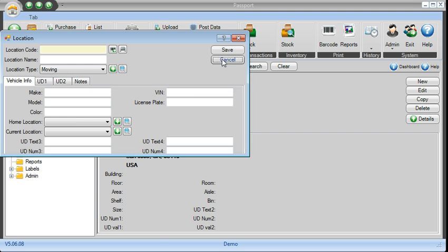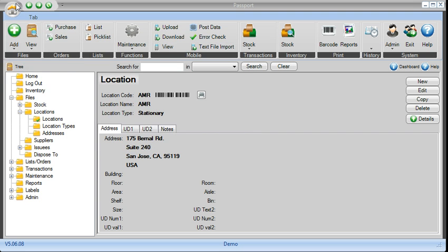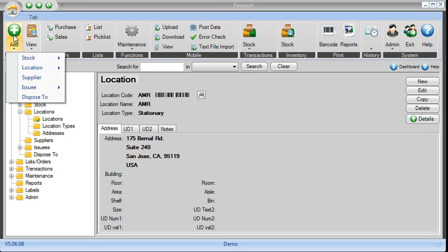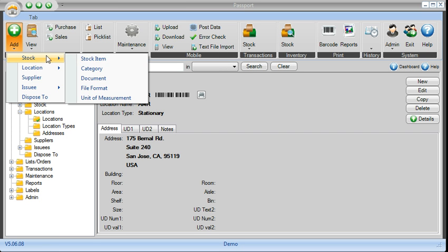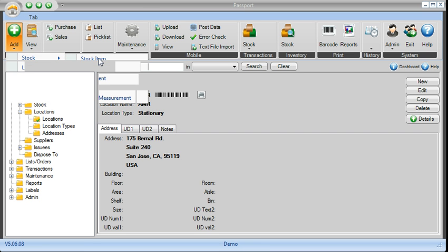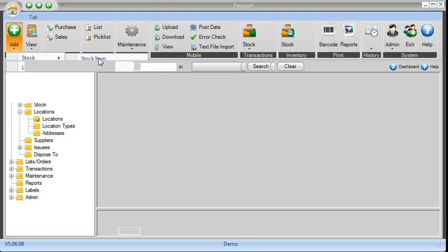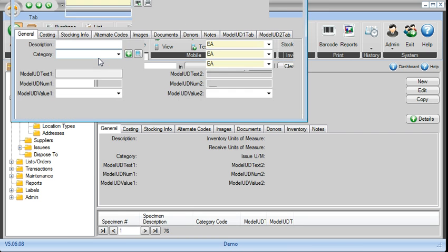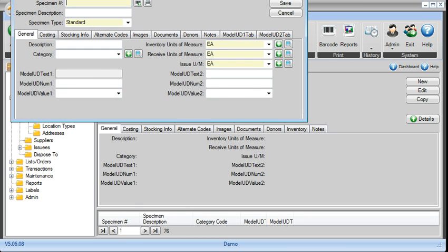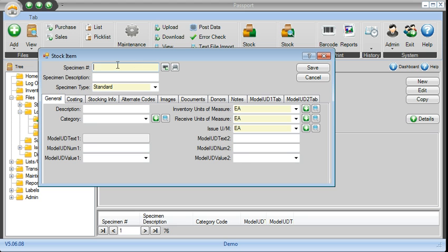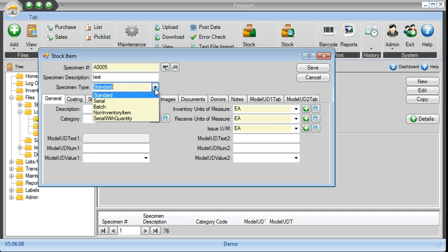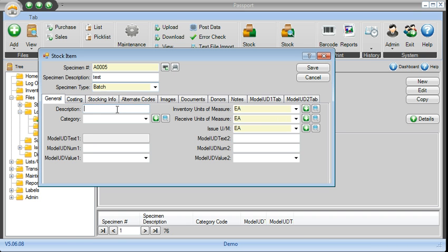So once you pre-create your locations, the last thing you're going to do is just start defining all the specimens that you will have to track moving forward. The definition is as easy as filling up the form, so you give it a number, you give it a description, you pick the type, so let's just say it's a batch type, put in description.